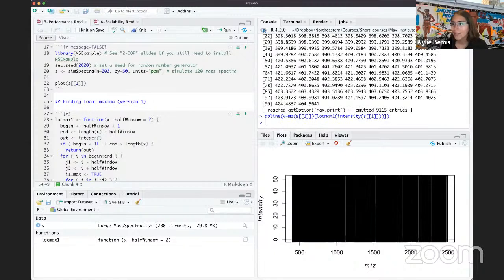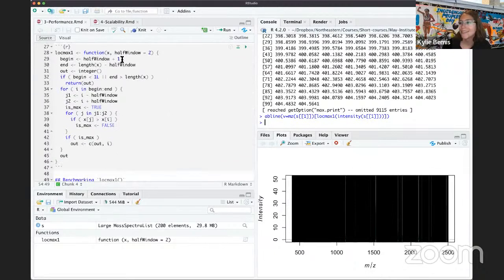Oh, okay, well, that's a lot of local maxima. So maybe you'll just trust me that this does work. Maybe I can zoom in further, but I don't want to take too much time trying to check this super diligently. Let's say 400 to 450.